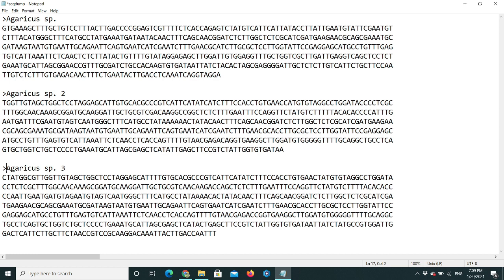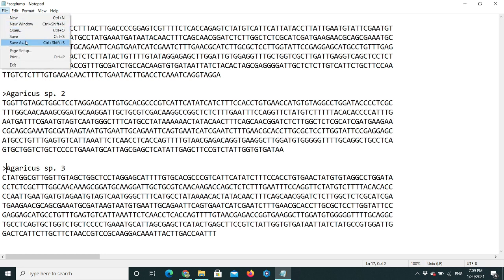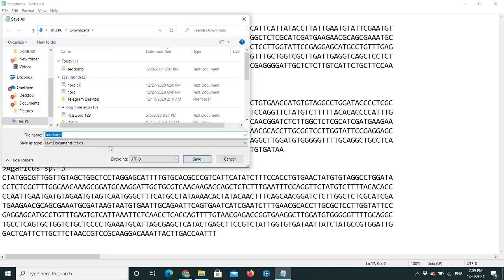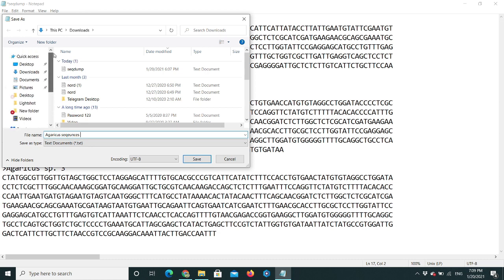Now let's save the file. NCBI recommends you save your sequences in plain text format, so we are going to save this file as a .txt file. Save it as 'Agaricus sequences'.